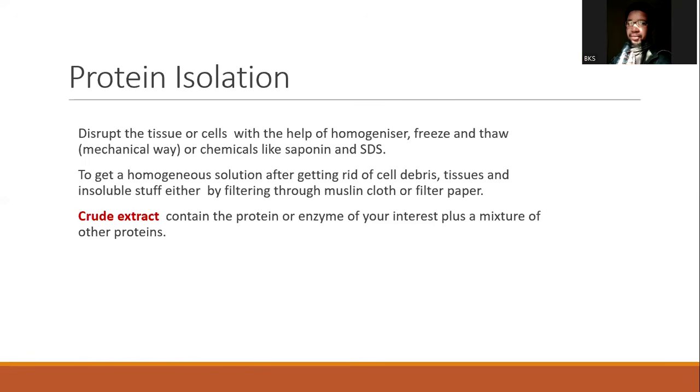But if you're interested in a protein located in a particular organelle, then you can carry out differential centrifugation, where you centrifuge, remove the larger organelles like the nucleus and the mitochondria, and go to the next spin at around 20,000, get the next one, like this, until you get the organelle of interest in the pellet. Then you collect it and break it open also, so that what you have are the components found in that organelle specifically. So all the proteins are there.